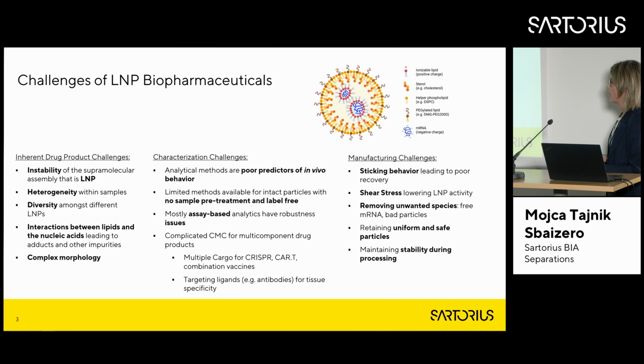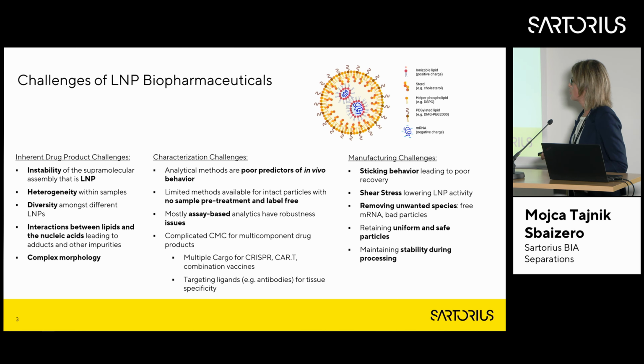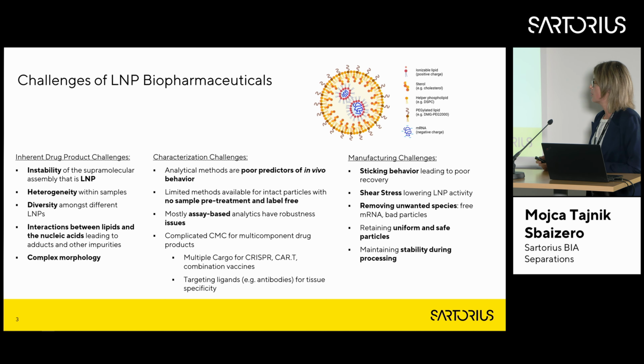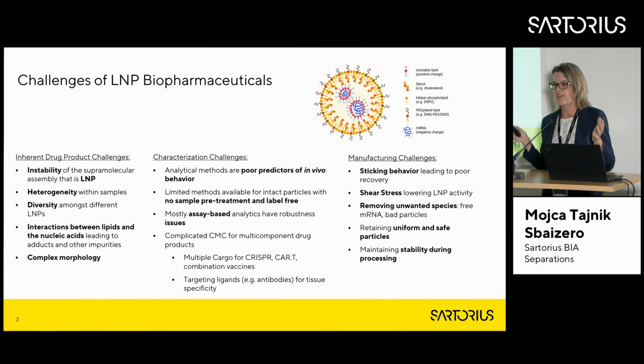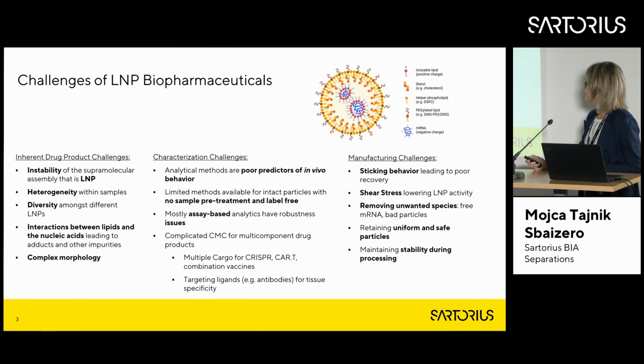So challenges we are facing, also this was introduced. First, we have the particle that is not very nice to purify. It's unstable. It's very sensitive to the shear stress. It's heterogeneous, so a lot of different LNPs for different drug products. The samples are diverse, and also there is very complex morphology, so what actually is on the surface, what the column will see at the end.